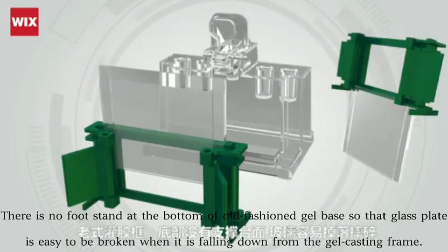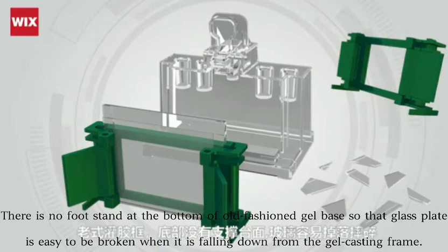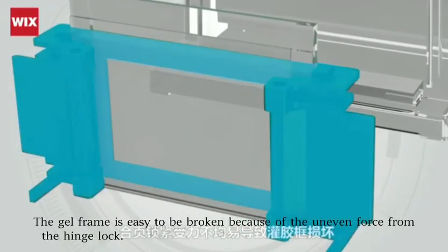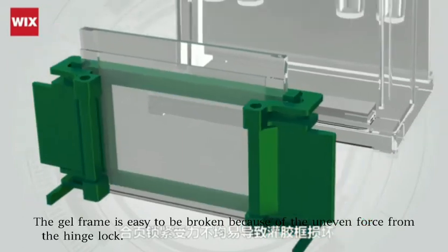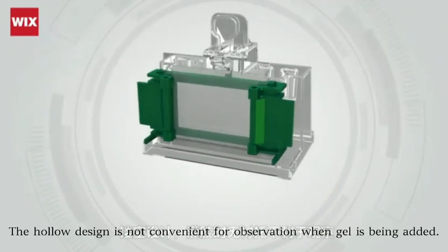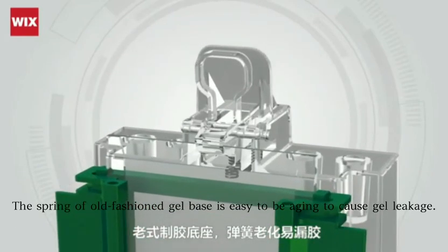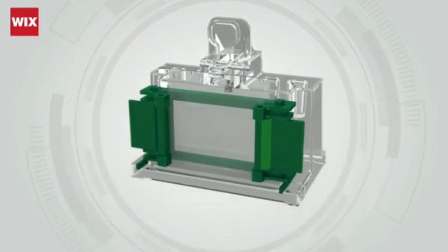The old-style gel base has no support to prevent the glass plate from falling down. The gel frame is prone to breaking due to uneven force from the hinge lock. The hollow design is not convenient for observation of gel casting. The spring of the old gel base is prone to aging, causing gel leak.